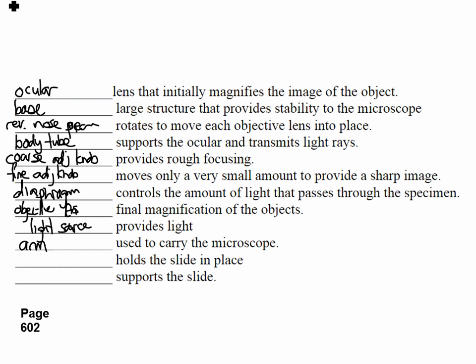Holds the slide in place. Yep. Ryan? Sorry? The stage clips. Yeah, go ahead. Yep. You want to put arm and base? We've got base there as well. Arm and base. I'm good for that. I like that. You got the last one there, sir? The stage. The stage.